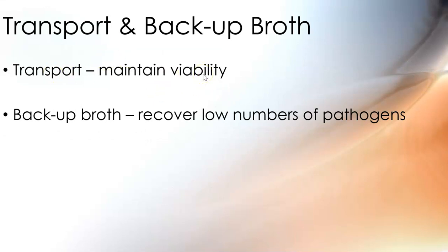We talked about transport medium. Transport medium is there to help to maintain viability, not to increase numbers of the organisms, right? And there's something called a backup broth. And this is one of the things that we do a lot. We'll plate our specimens on media, and then we'll put it in the thioglycolate broth or a brain heart infusion broth so that it's very nutrient-rich.